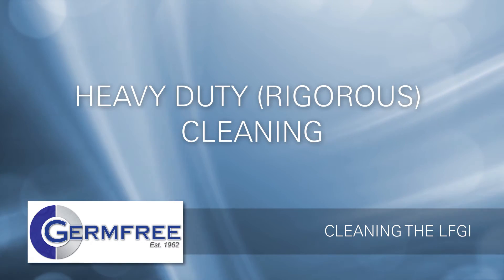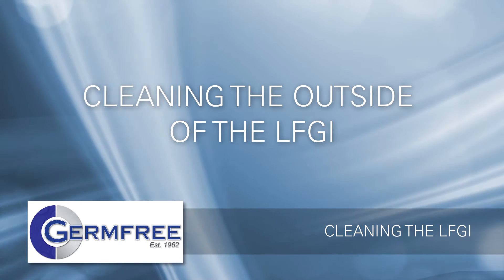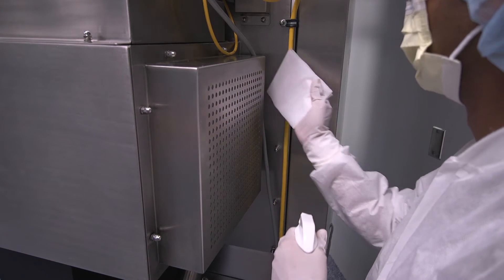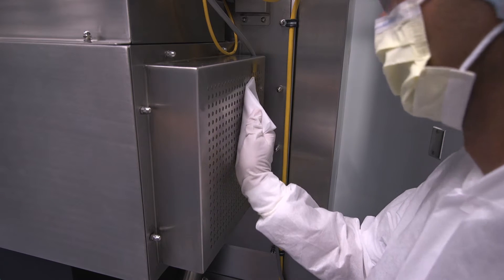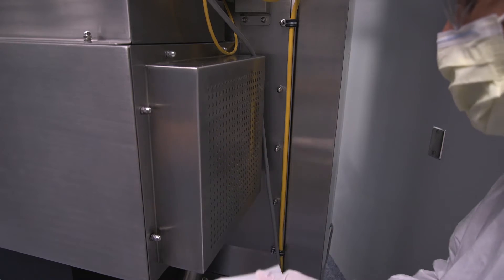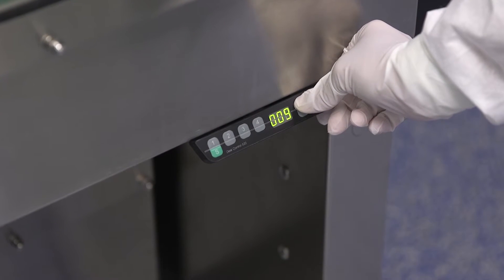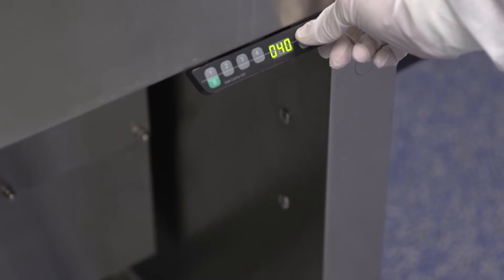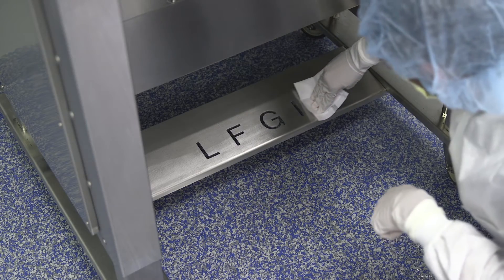You are now ready to begin your heavy duty or rigorous cleaning of the LFGI. The outside of the LFGI can be cleaned at any time. If the unit remains closed, no additional PPE is needed. Begin cleaning at the top of the unit. When cleaning the pre-filter at the top of the unit or any other HEPA filter on the LFGI, do not spray a cleaning liquid directly onto the filter. Saturate a wipe with disinfectant or sterile alcohol, then wipe the pre-filter. Clean each outside surface. The entire cabinet can be raised or lowered with the controls on the right side of the machine. Raise the stand at least 3 inches to make it easier to reach and clean the caster cross supports.